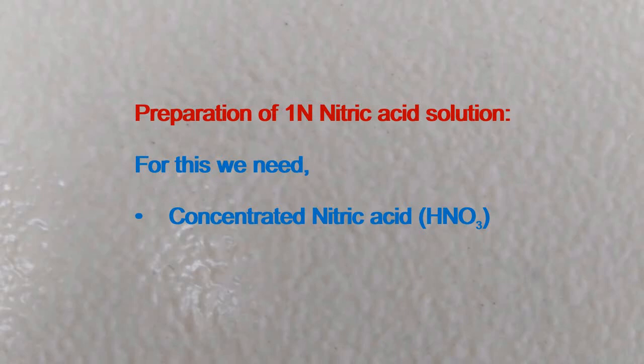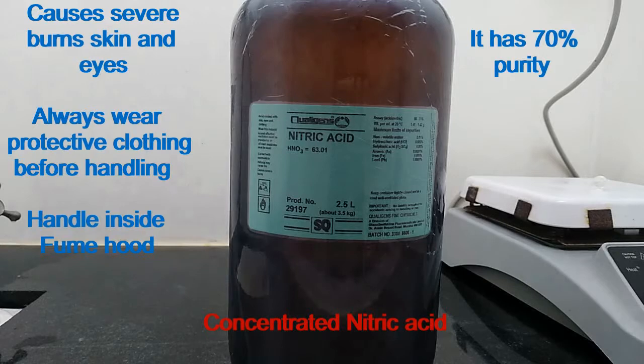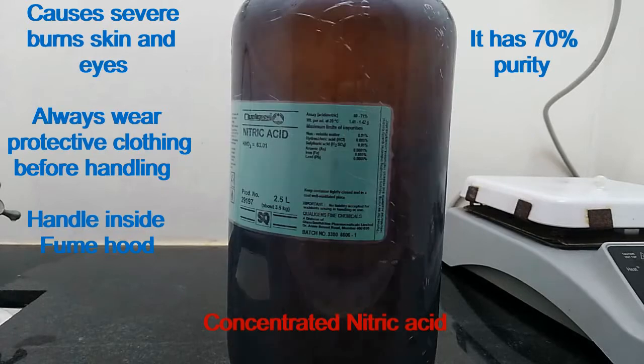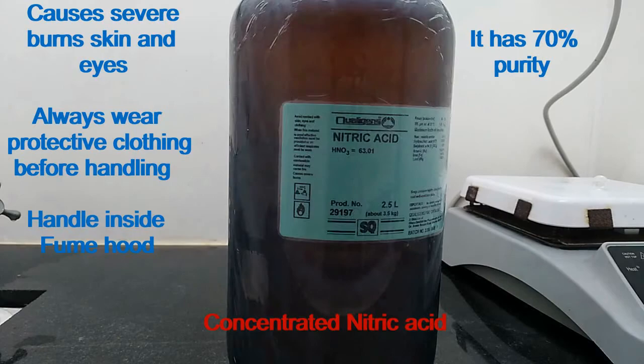Preparation of 1N nitric acid solution. For this we need concentrated nitric acid. This is concentrated nitric acid. See the hazard symbol. It causes severe burns to skin and eyes. So always wear protective clothing before handling and handle inside a fume hood. It has 70% purity.